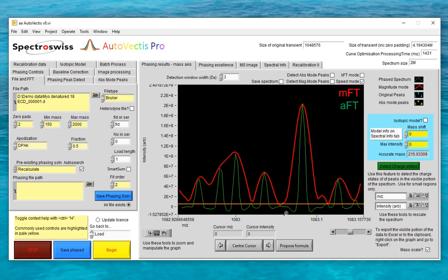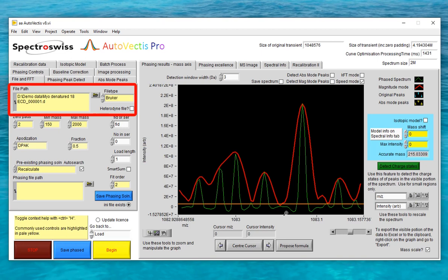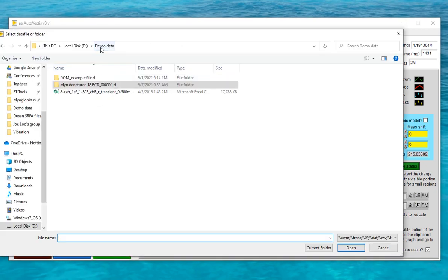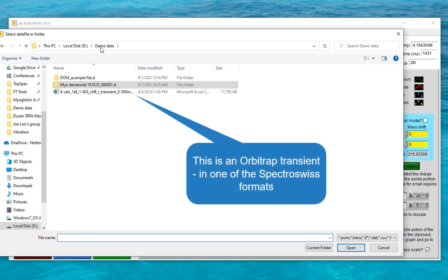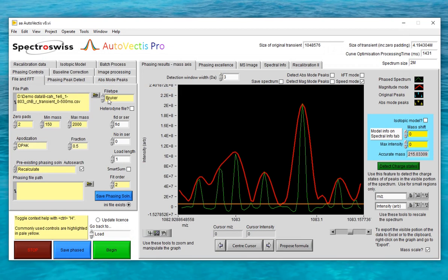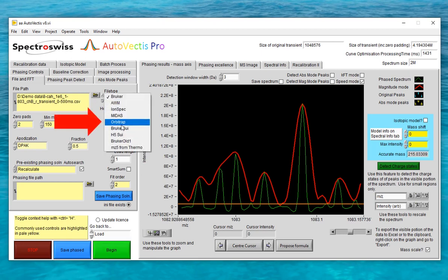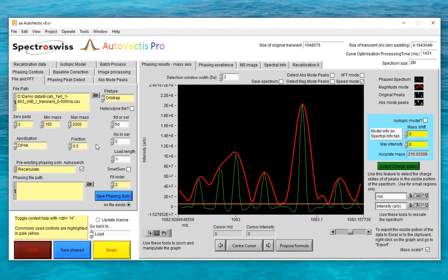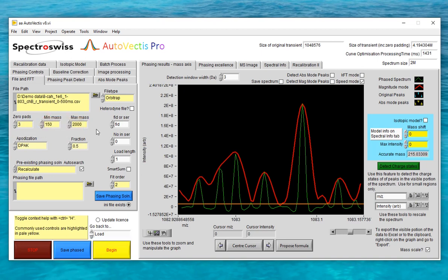Let's try processing an Orbitrap file by this Recalculate route. The first thing I need to do is change the file path and the file type using these controls. This file contains an Orbitrap transient in one of the Spectroswiss formats saved from their booster unit. We also have to tell the program that we're using an Orbitrap type transient, so we'll select the Orbitrap option in the file type box. And because this is a short Orbitrap transient, I'll also increase the number of zero pads to three. Apart from those three changes I won't make any other alterations, and now we can just hit begin to start processing.